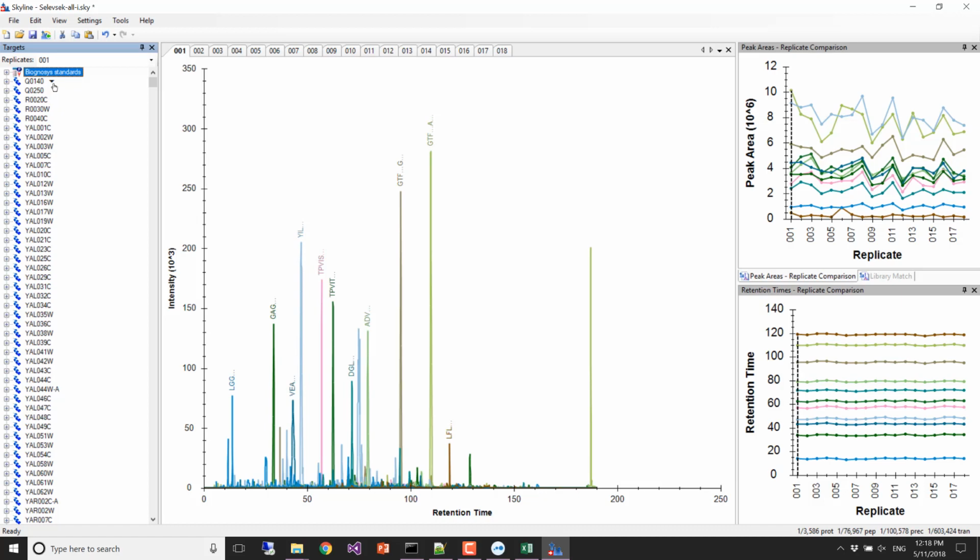So I want some reproducibility of detection, and then I included quantitative reproducibility by using a CV filter. So it's a 2-point filter, below 20% CV with 4 detections.